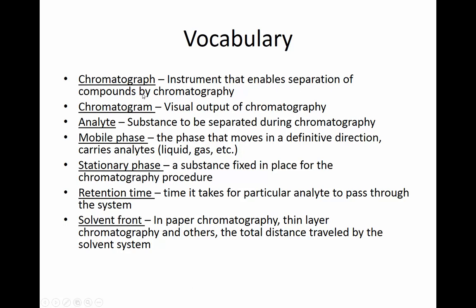And what these do is they will pump liquid that should have some compounds dissolved in it over a column, which is the stationary phase. And this column and the liquid that's pumped over it will help separate the molecules based on the molecule's affinity to either the column or the mobile phase, that solvent.